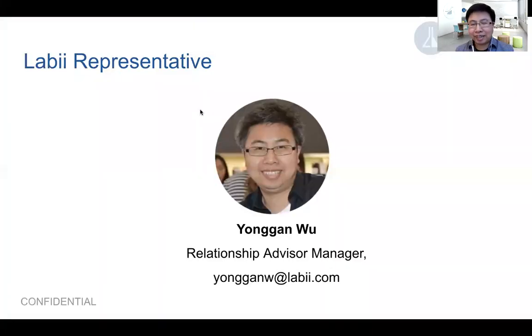And then I will start by introducing myself. My name is Yonggan Wu. I'm the relationship advisor manager here at Labii. So for today, I'm going to give you guys some updates, and of course also include how you can use our platform, and then some basic use cases.